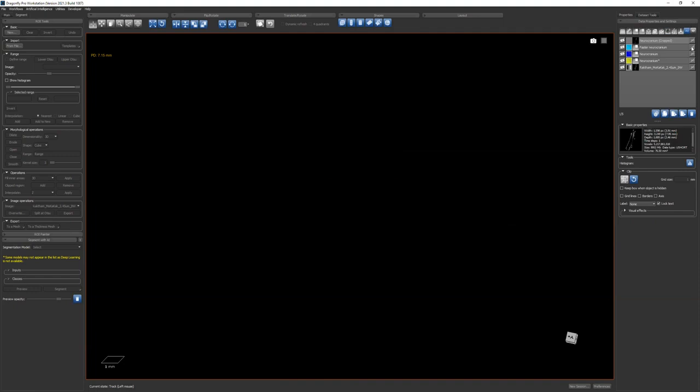Also, see here are the properties of your volume over here on the right. This volume, the neurocranium one, is 9,000 megabytes or 9 gigabytes. And this one is 27,000 megabytes. So when we cropped, we cut it by a third, basically. Right. By 2/3. There's a 3 in there.